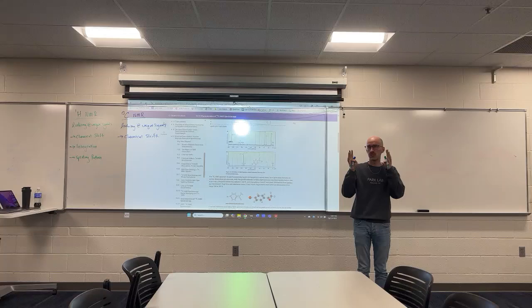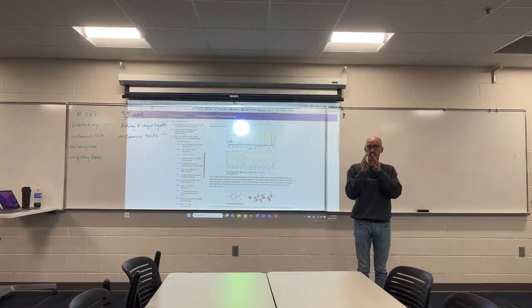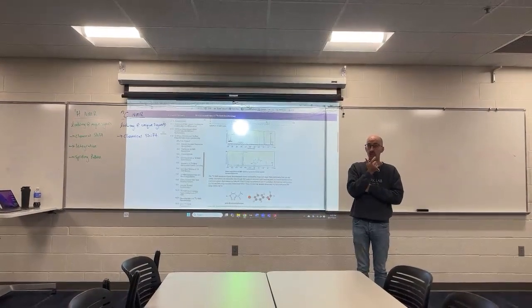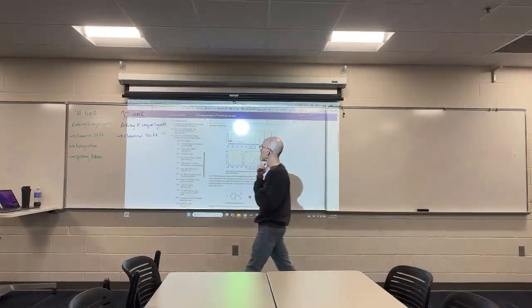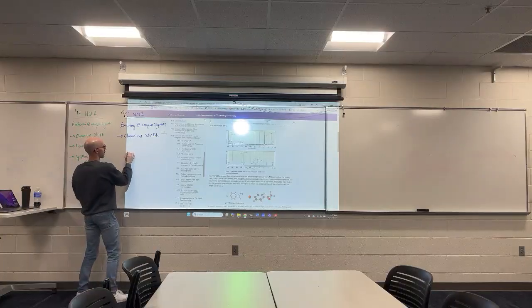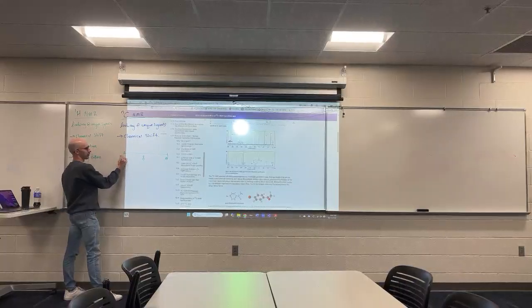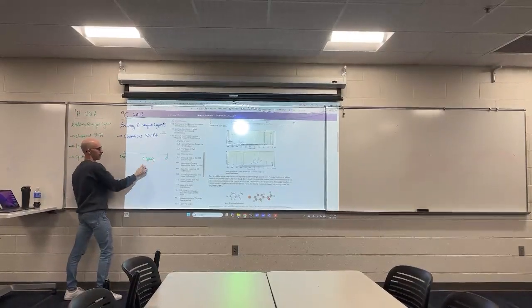They actually don't overlap quite as often as proton signals do. So you can count all of the individual peaks in a carbon NMR and find how many unique carbons are in your spectrum, in your compound. And once again, the chemical shift here, or delta, ranges from about 0 to 250 ppm.